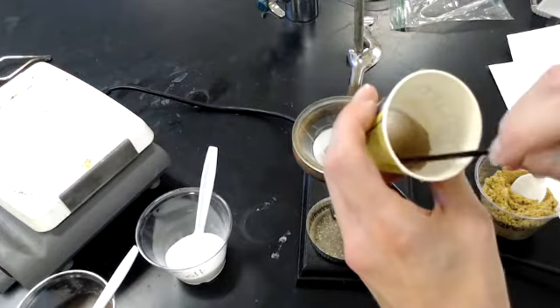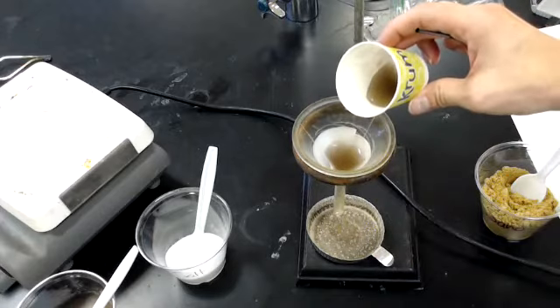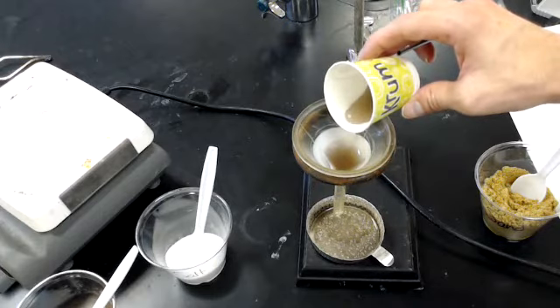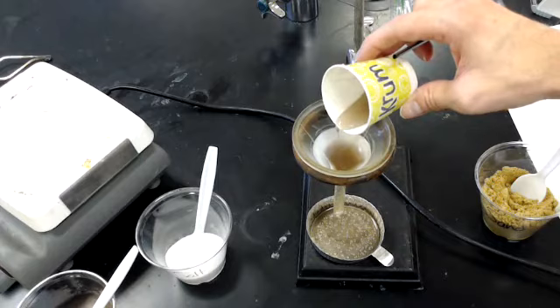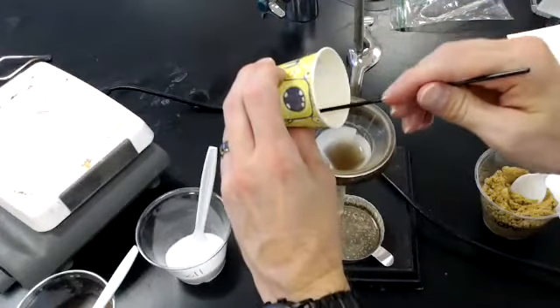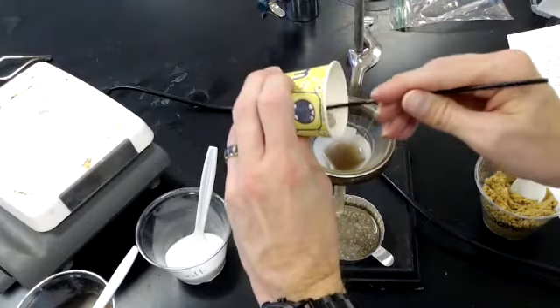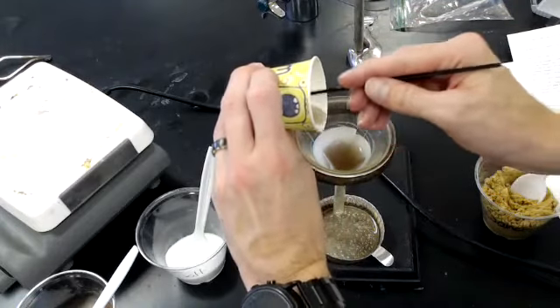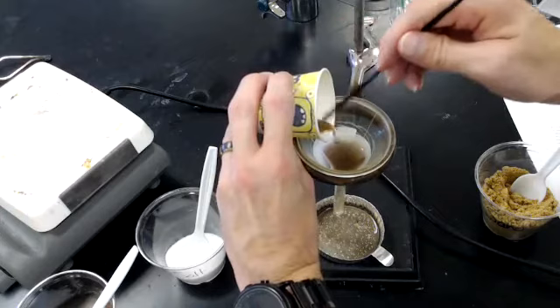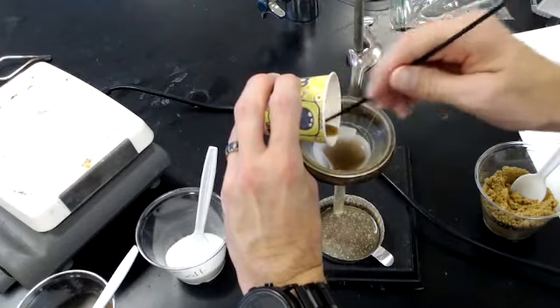Okay, while I'm here, I can use my little stir stick. So you can see some liquid pouring through the filter paper into the evaporating dish. Here goes more. My ultimate goal is to get the entire cup emptied out into the filter paper. And this could take a while. So I'm going to scrape. I'm going to use water as needed. I want to get all the stuff that was in the cup into the filter.